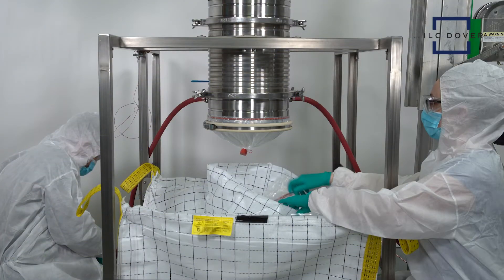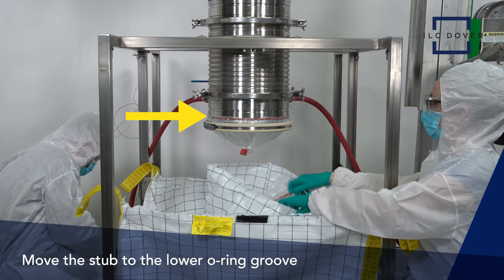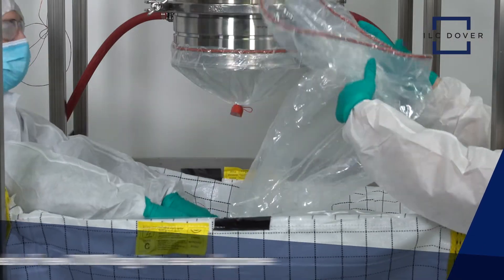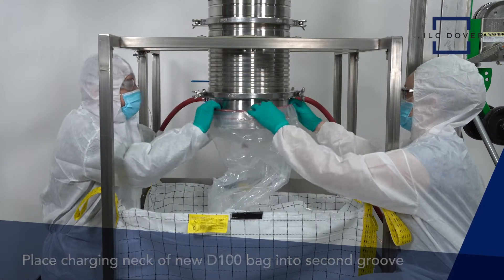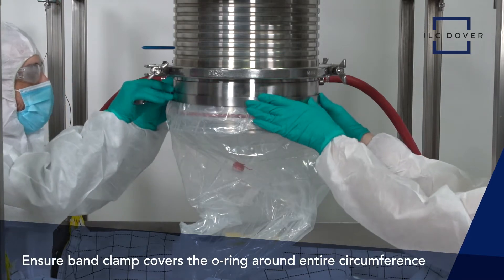After unfolding the D100, begin attachment by moving the stub to the lower o-ring groove. Next, take the charging neck of the new D100 bag and place it on the second groove of the canister. Ensure that the band clamp covers the o-ring around the entire circumference of the canister.